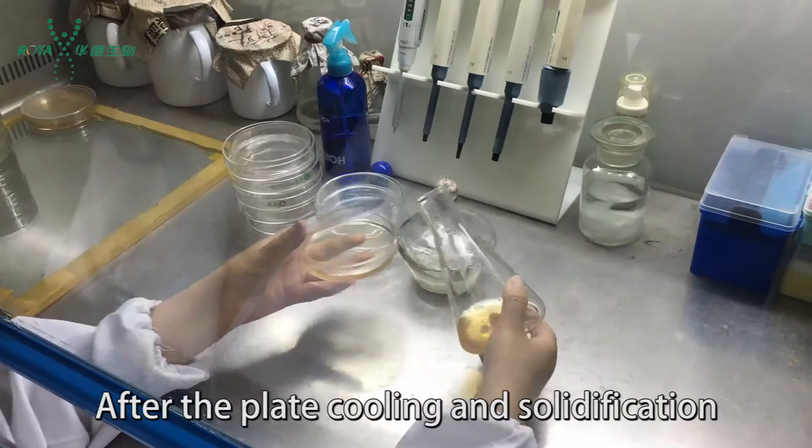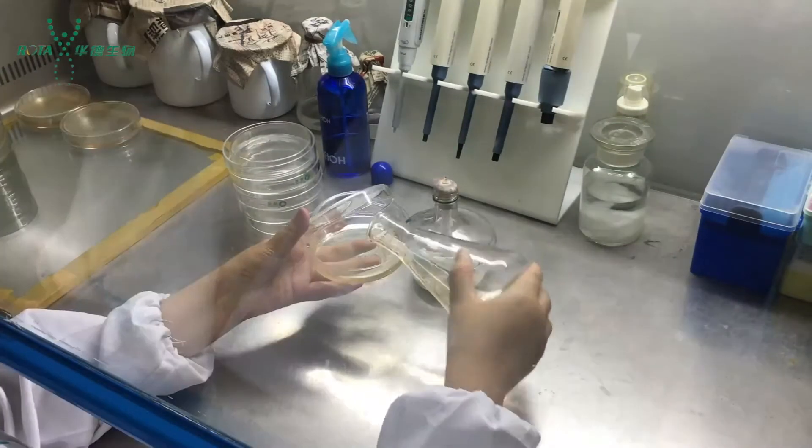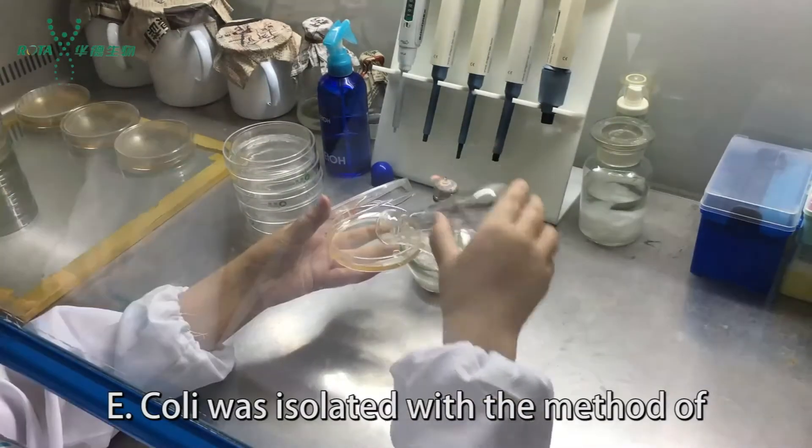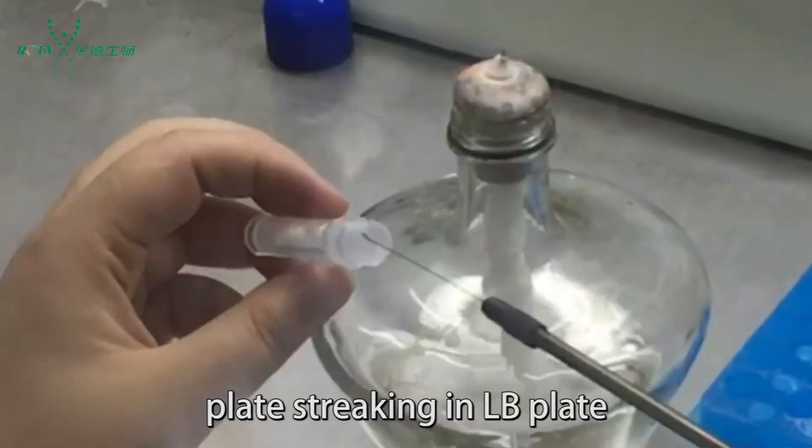After the plates cool and solidify, E. coli is isolated using the plate streaking method on LB plates.